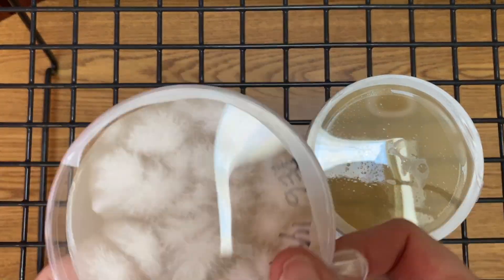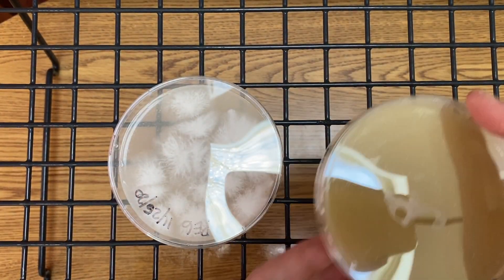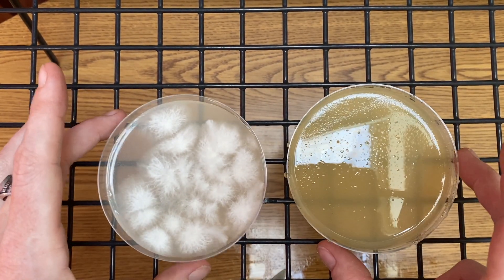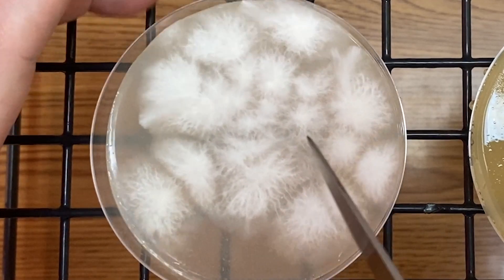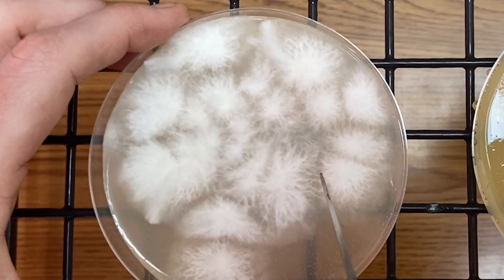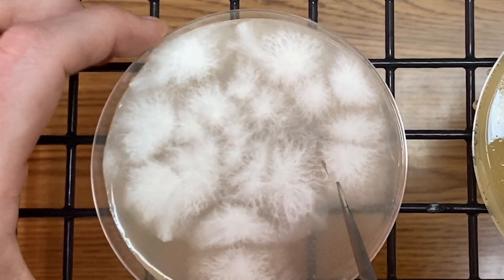First, I recommend being in front of a laminar flow hood or in a sterile environment. Then, sanitize everything before you start. There are two major classes of mycelium: rhizomorphic and tomentose. Rhizomorphic mycelium is more strandy and stringy looking, and tomentose mycelium is more cottony and fluffy. Rhizomorphic mycelium is also known to grow faster and more apt to produce primordia. So knowing these facts, we definitely want to transfer out our rhizomorphic mycelium so we can have better genetics.